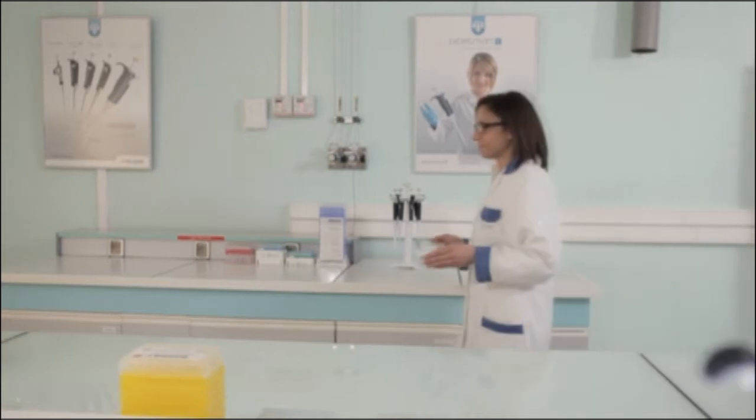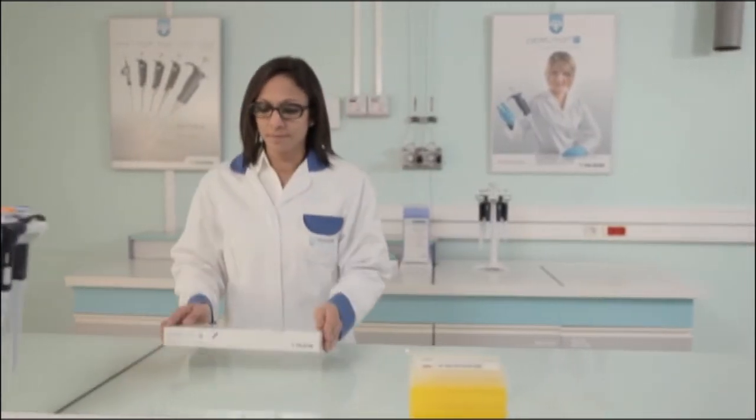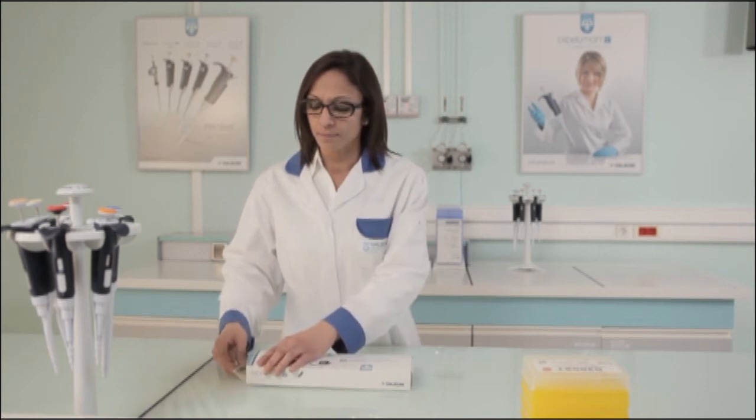Good results and great comfort are essential needs for daily pipetting. Let's find out how the Pipet-Man L can bring all these benefits to your lab.